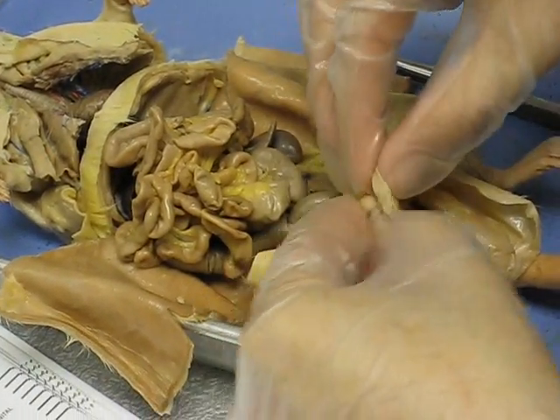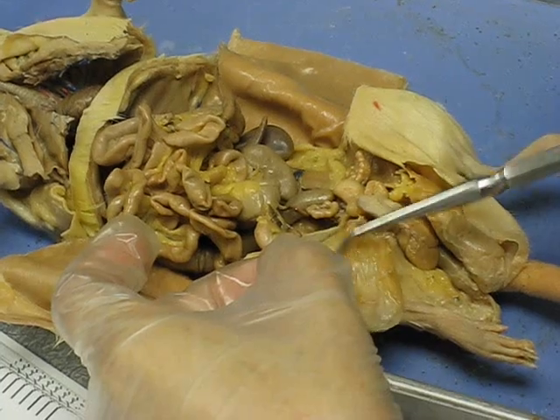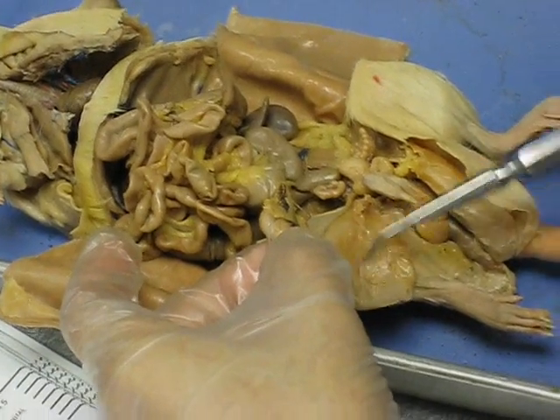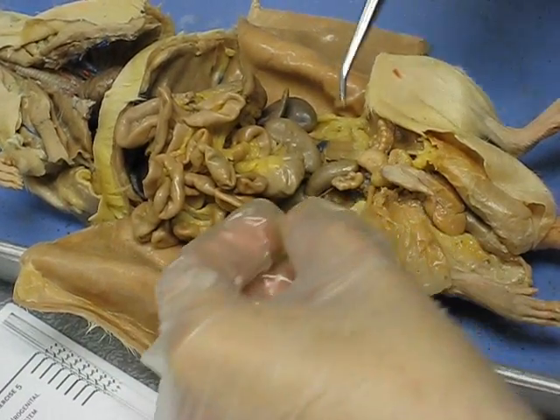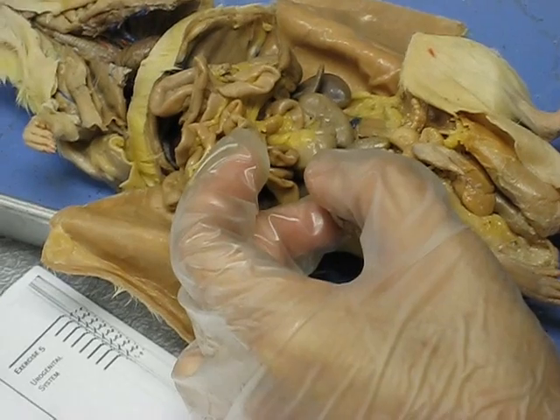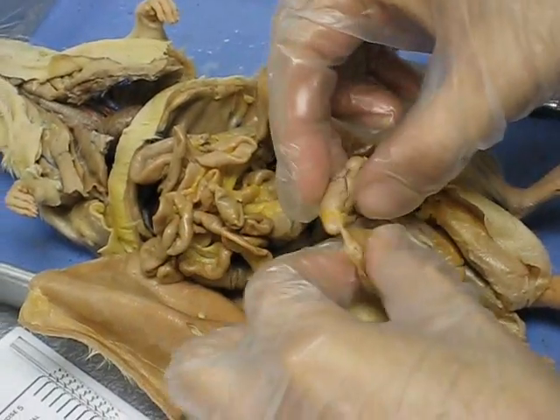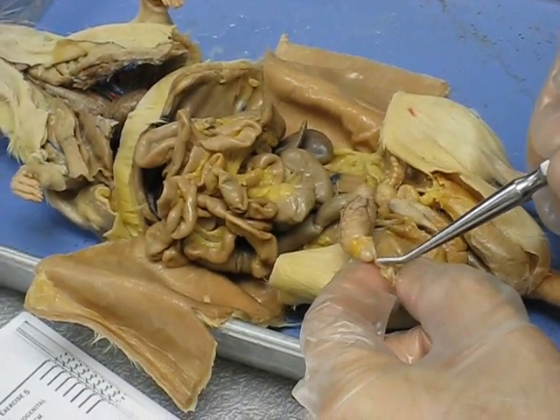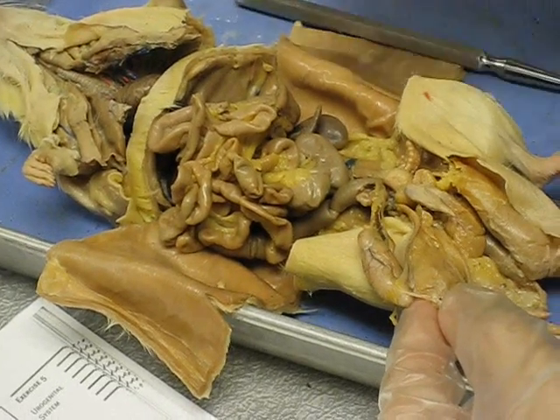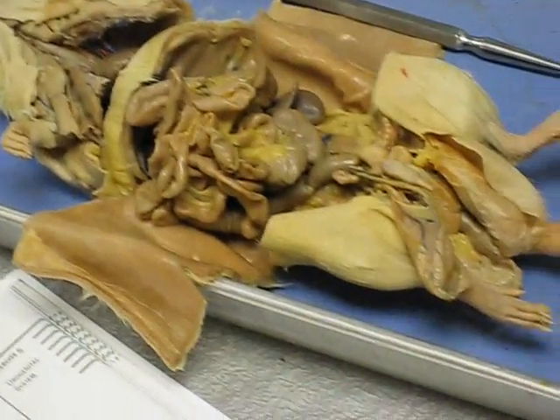Within that is the testicle. Here — we've opened up the cremasteric pouch and taken out the testicle and epididymis. There's some mesentery that connects the testicle to the cremasteric pouch — this is known as the mesorchium. The mesorchium connects it, and as we get down to the end of the testicle and epididymis, it thickens into what's known as the gubernaculum. The mesorchium and gubernaculum hold the testicle in place so it's tightly bound and not moving around.